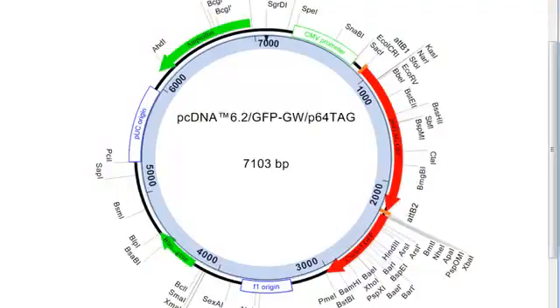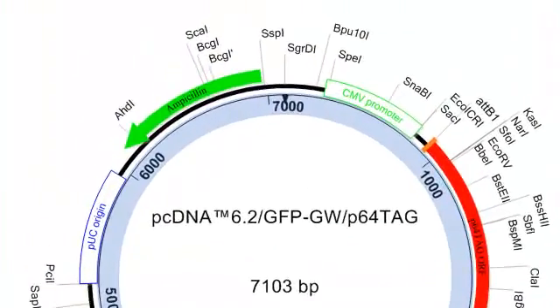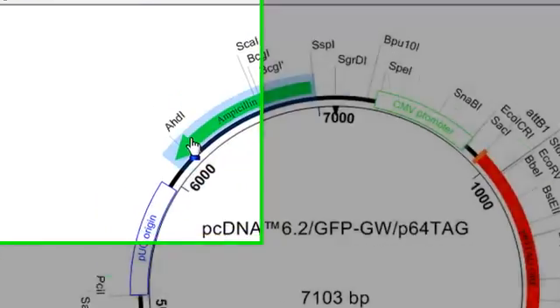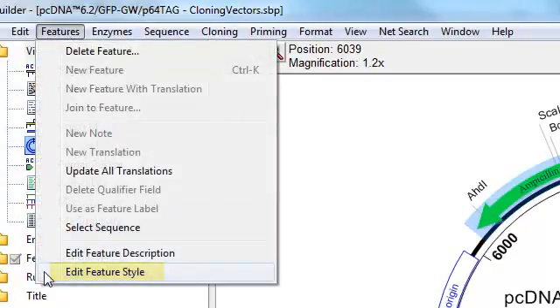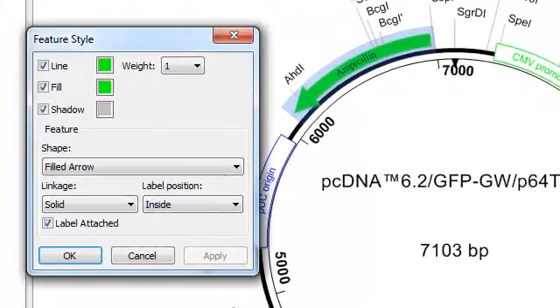Another way to change the appearance of your map is to edit your feature styles. So, for example, if I wanted to change the color of this ampicillin feature, I could just double-click on it to select it and then choose Features, Edit Feature Style, and that shows me the Feature Style dialog.